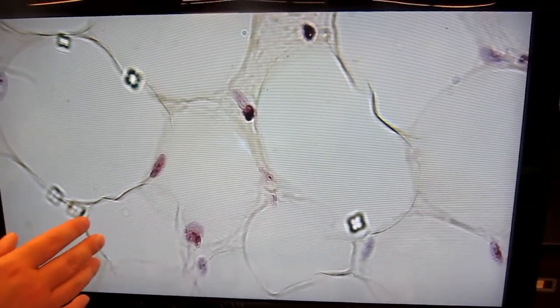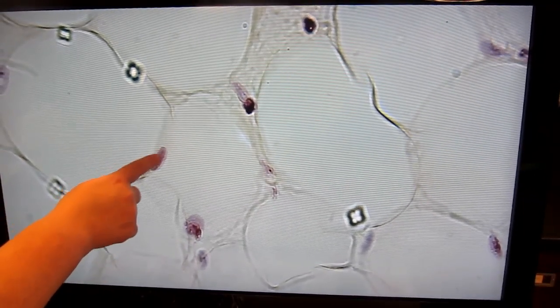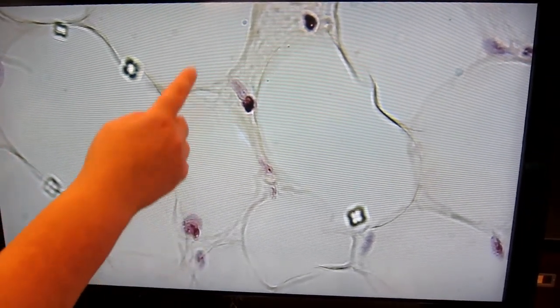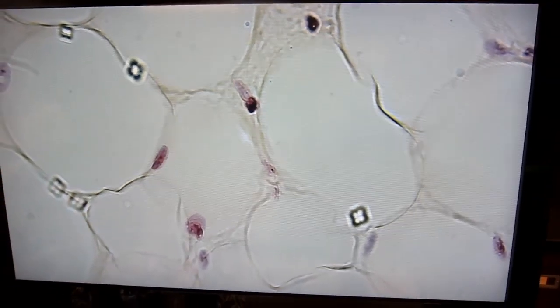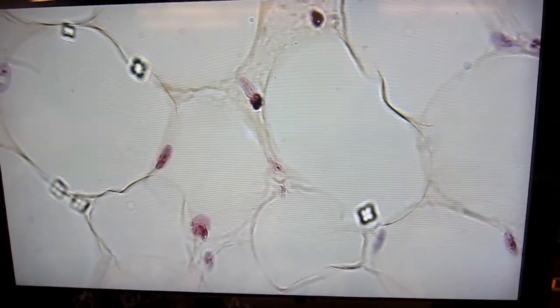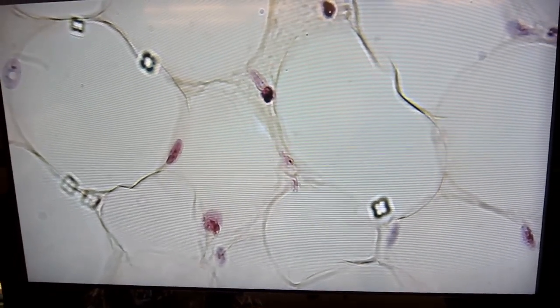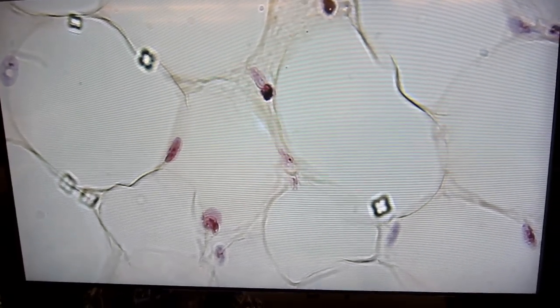If you're an adipocyte, you just have that one nucleus. There won't be any others around. So large swollen cells, nucleus pushed out to the edge, not a nucleus visible in each cell. Classic adipose connective tissue.